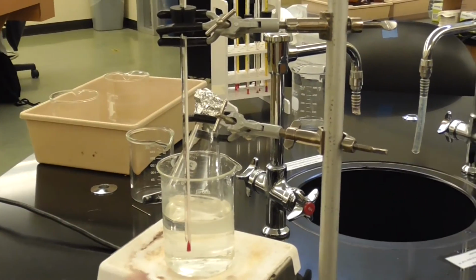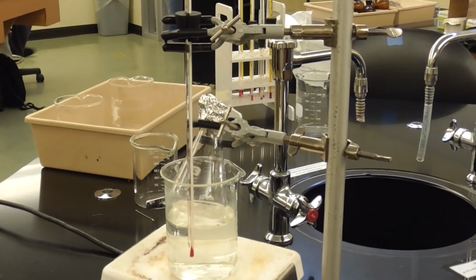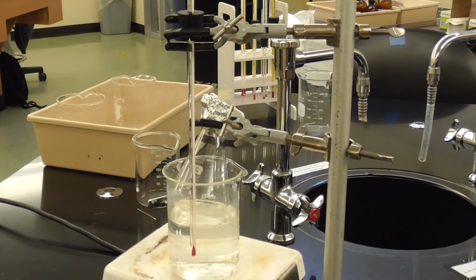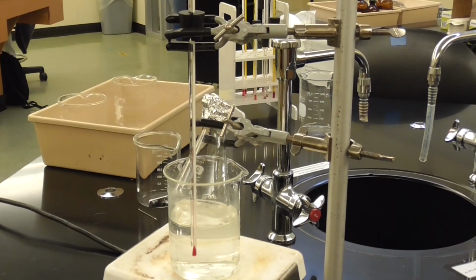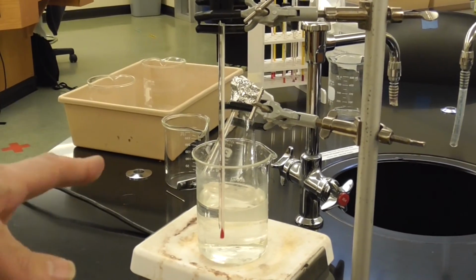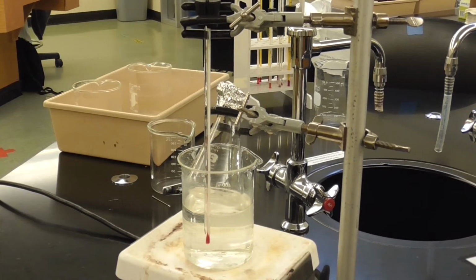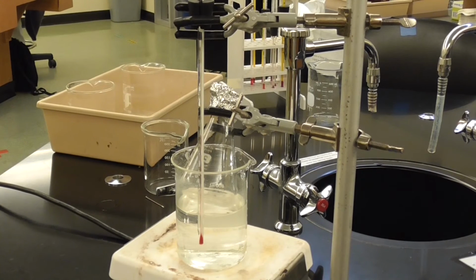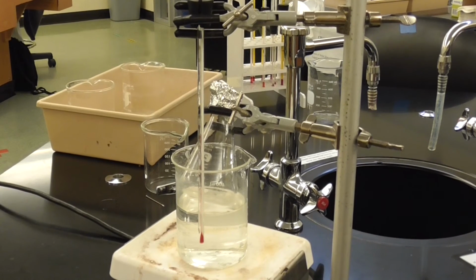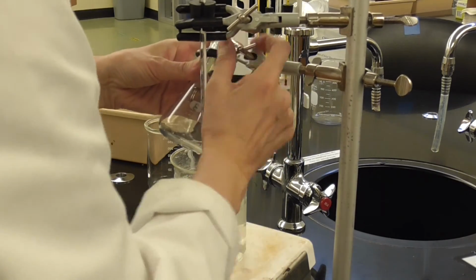We have the beaker, and then we're going to put the Erlenmeyer flask. We're not going to submerge it all the way, just a tip of it, and we're going to boil the water, and then we're going to measure the temperature at the time when all the liquid inside the Erlenmeyer flask has evaporated. We're going to remove it from the heat, from the water, after we measure the temperature at which it totally evaporated.